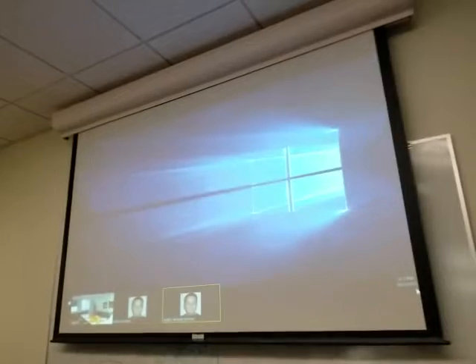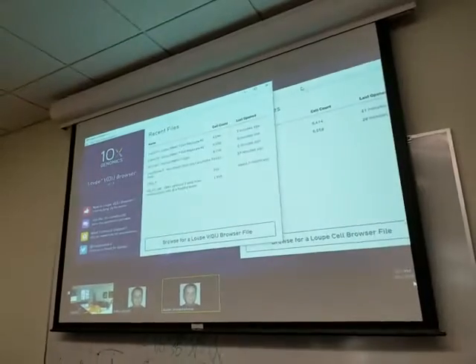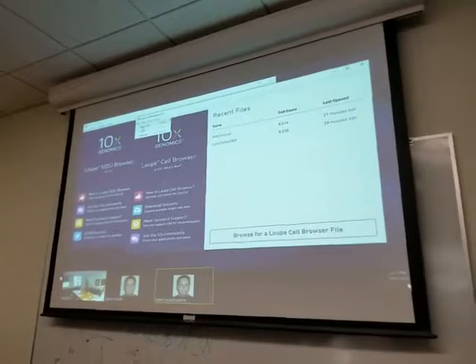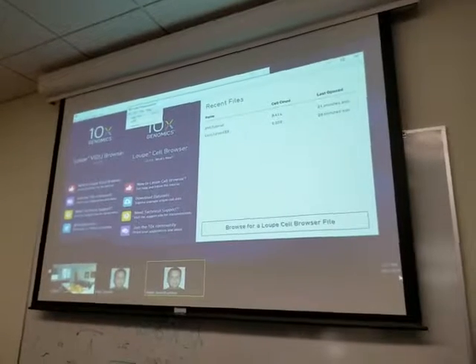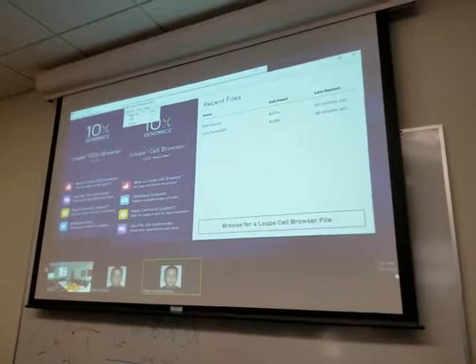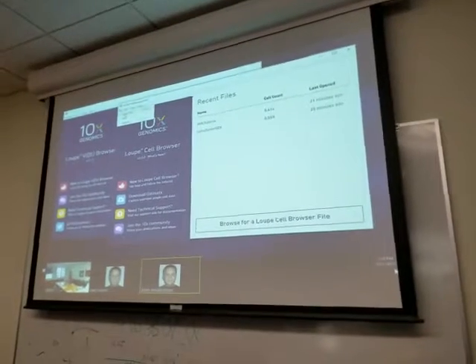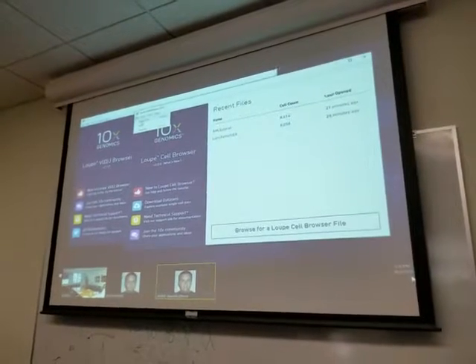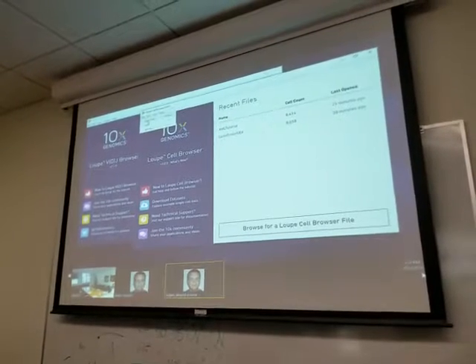And I guess once we export, like the barcodes, what is the best next program to look at repertoire? Is there a program everybody says, oh yeah, this is the best? Yeah, I don't think so. Not yet. It's so much newer than gene expression. At this point, gene expression at single cell level is probably about 4 years old if you include the time that Drop-seq technology's been around. Whereas paired heavy light chain or alpha beta at single cell level is basically just our product.